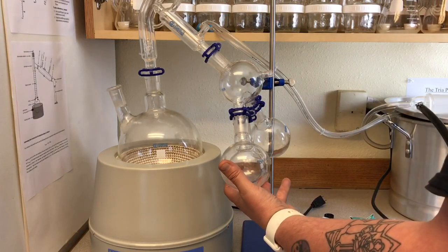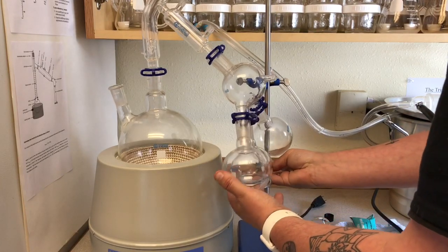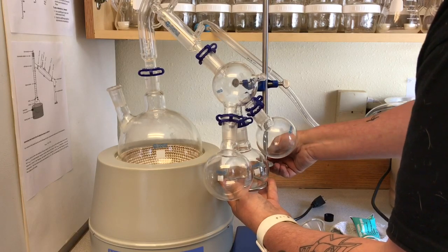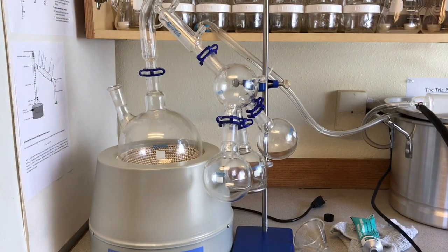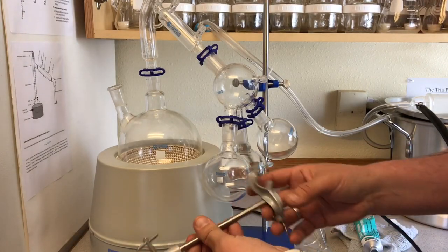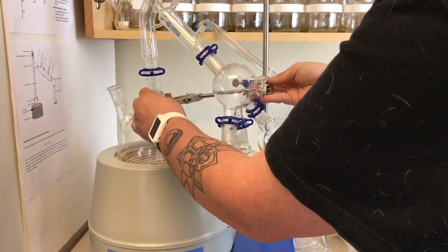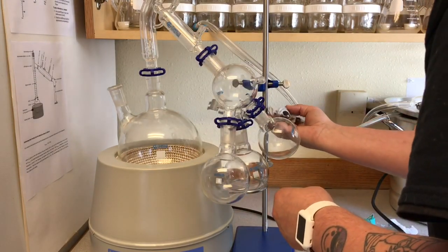So now we've got this set up. The next piece that we'll add will be this guy, and this will help us just to keep this from falling over. This is a flask holder here, and that looks good there. So here's our next piece that we're going to add. This piece is called a boss head, and this is a retort clamp. So we'll take this clamp and we're going to clamp it onto right here. And I think I'll just lower this guy down to here.